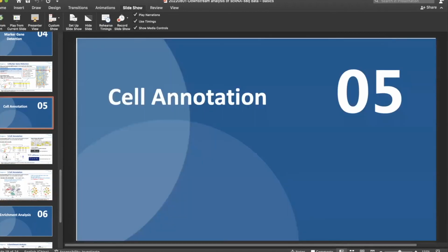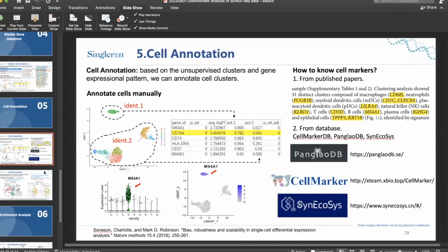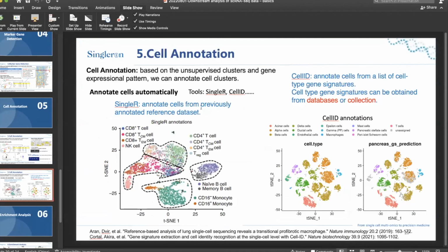Can you elaborate a bit on using reference single-cell RNA data, for example, Brain Atlas, and how to integrate them in SingleR or other approaches, especially with respect to normalized or scaled data? And, just to add, what are the major pitfalls when using external sources like the Brain Atlas?